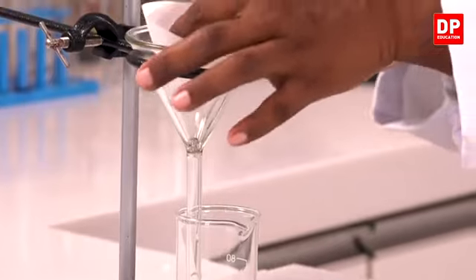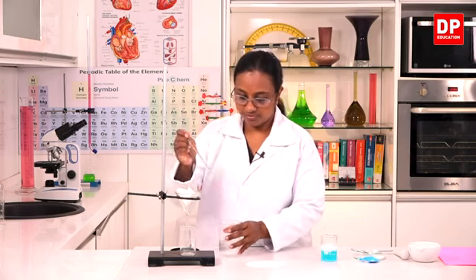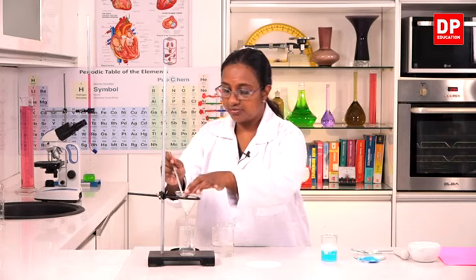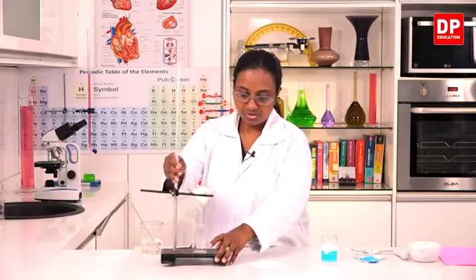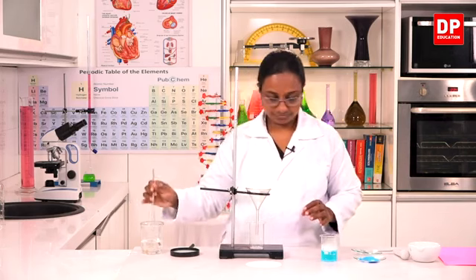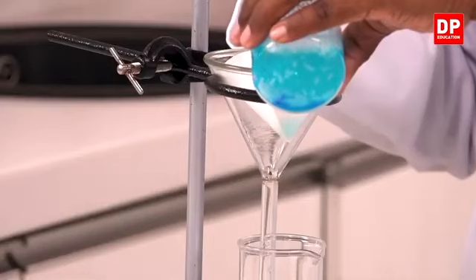Then if we put a few drops of water, the filter paper will stick to the funnel, to make sure that it sticks to the funnel properly. Okay. Now I can transfer the solution into this. So here I will filter this solution.